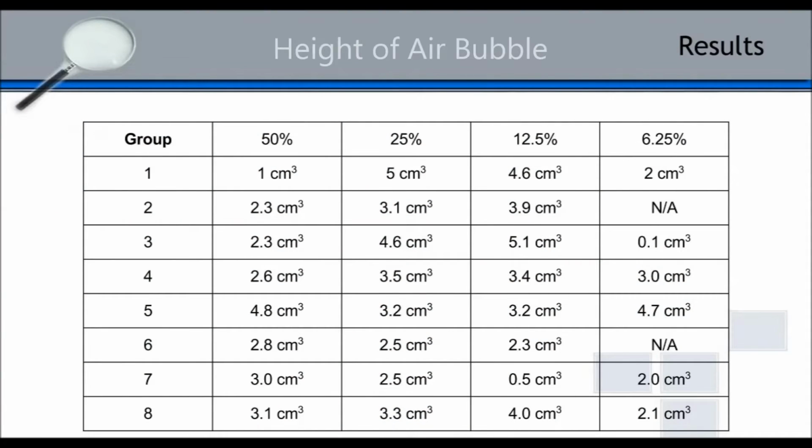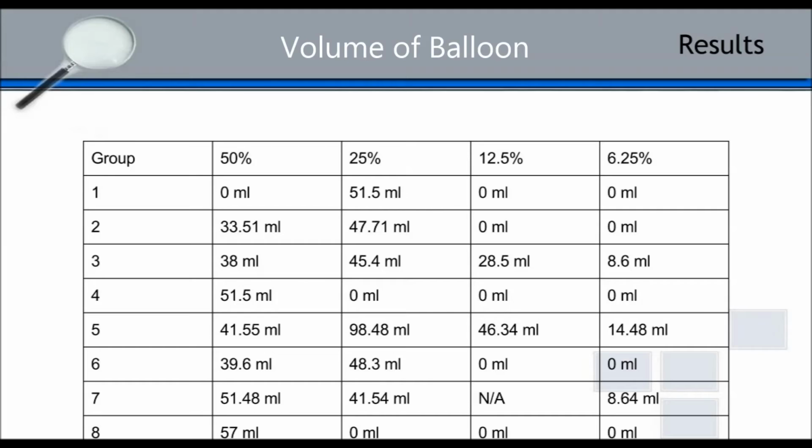The data for this experiment was measured in the size of the balloon in cubic centimeters. The results showed that concentration differences did not make a measurable difference as far as the results variation goes, but there seems to be a very, very small, almost undetectable positive correlation between the concentration of molasses and the amount of carbon dioxide produced, but the data is not solid enough that we can draw an actual conclusion from it.